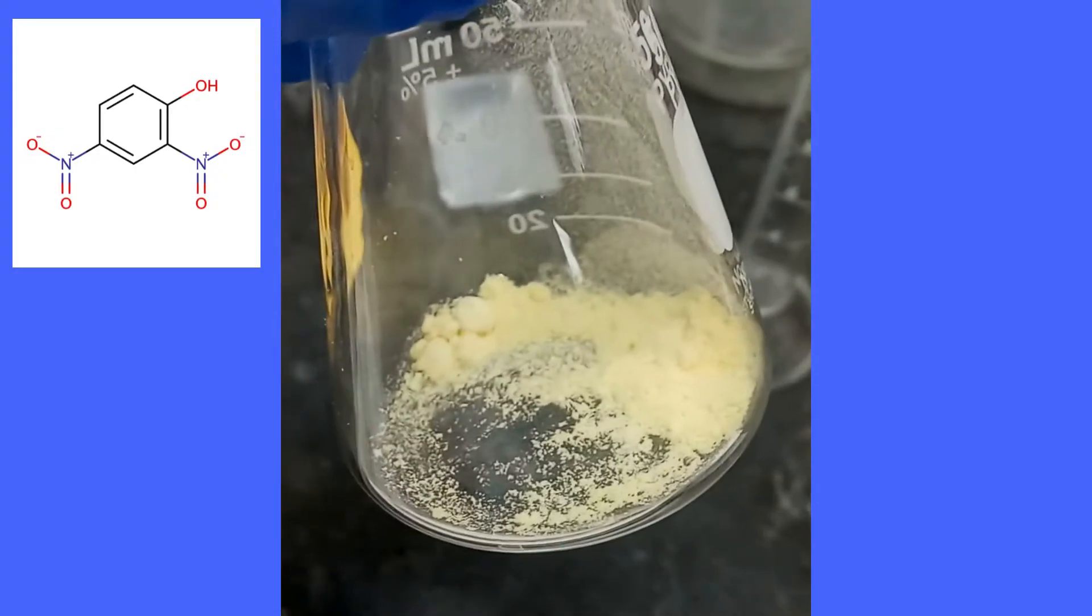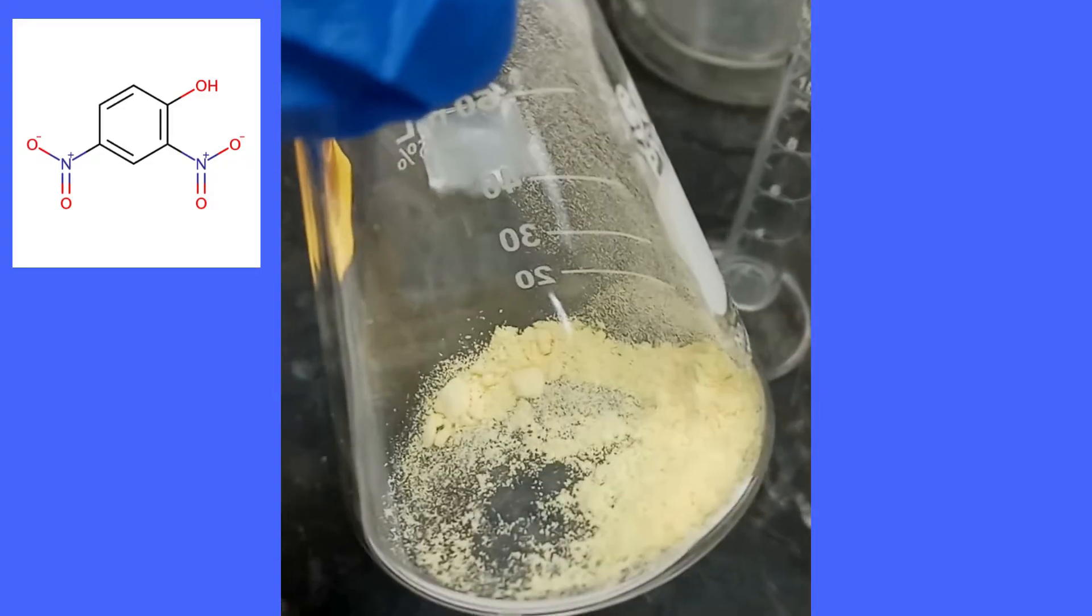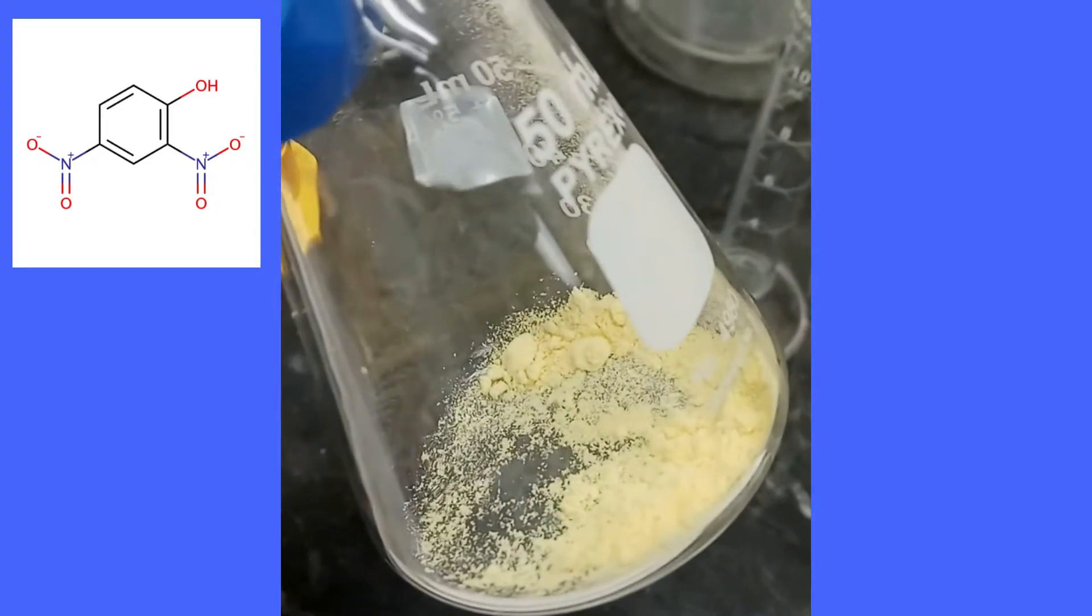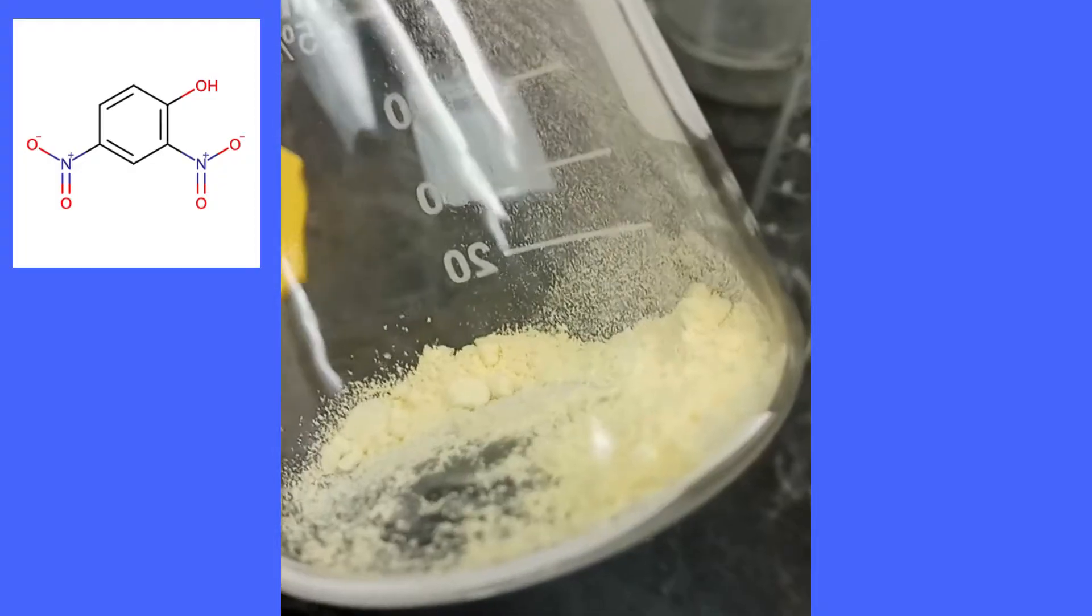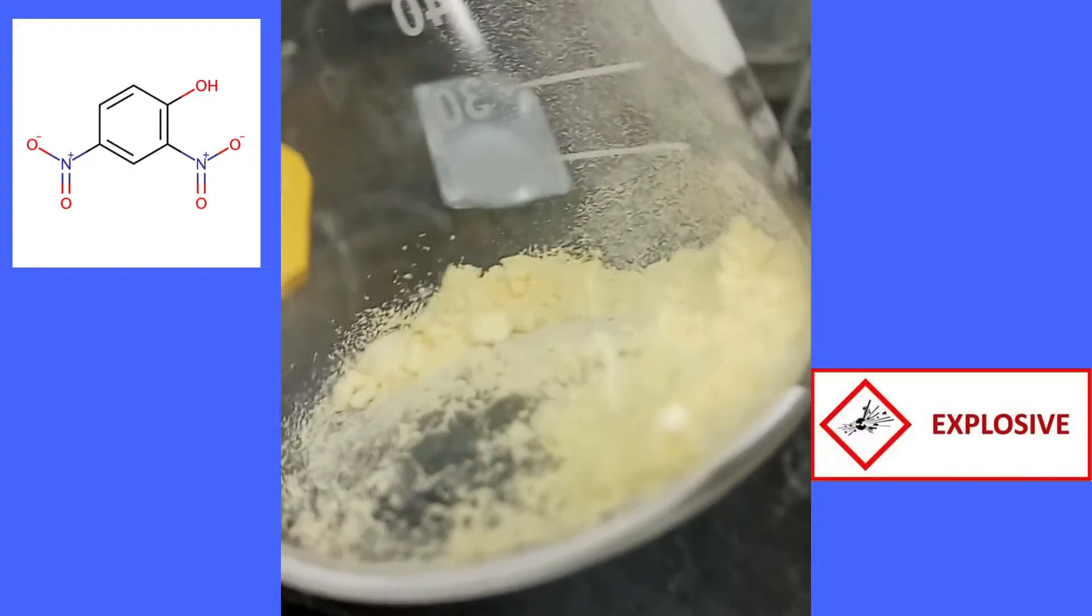We started off adding 600 mg of 2,4-dinitrophenol into a 50 ml Erlenmeyer flask. The powder actually contains 20% water so it doesn't explode, and so we've got to get rid of it.